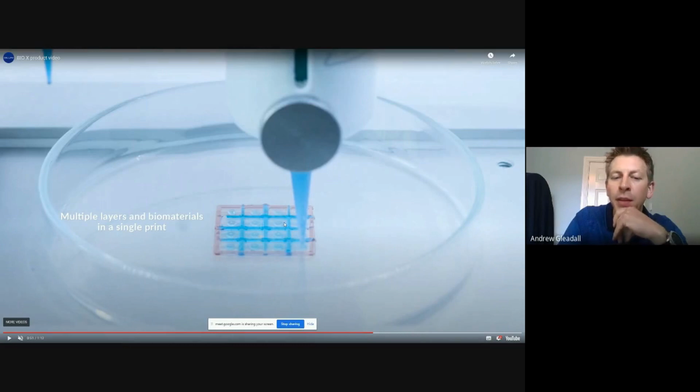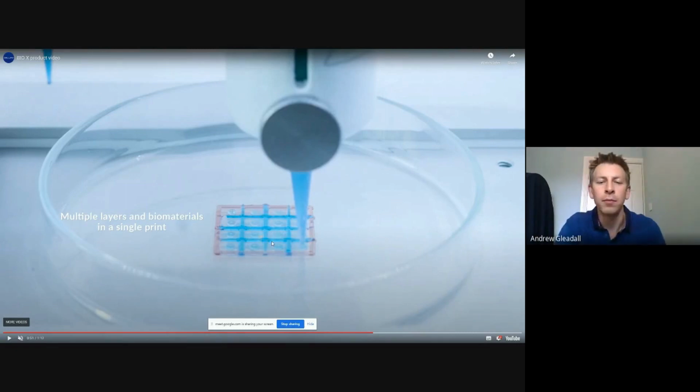In bioprinting, you might want a slightly different type of cell around the edge. You might want skin cells around the edge of the structure, and then a combination of, say, some soft tissue and some vascularization in the middle. These blue lines might act as blood vessels or something like that. Some of them might be just for structural purposes, and the blobs might be the bits that have actually got cells mixed in with that gel. I don't think I truly mentioned, often you'll print the gel and you can actually have living cells inside that gel.